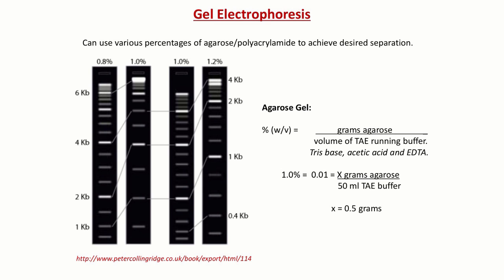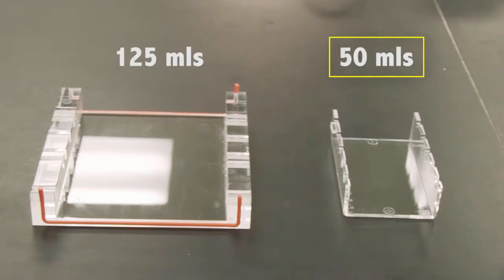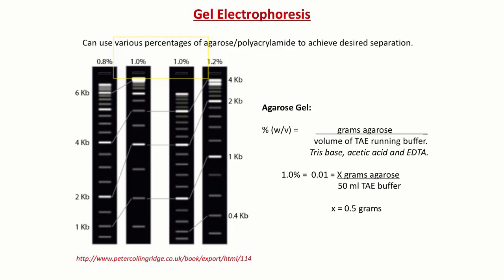The first thing to consider is what type of gel cast box you are using. You can have gels that are as small as 50 mL, or gels that can be as much as 125 mL. For our example today, we're going to work with a gel that has a volume of 50 mL.